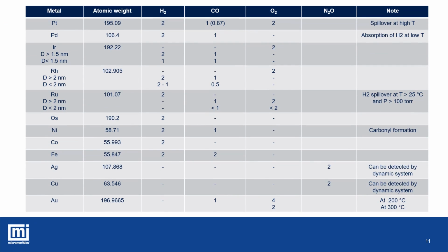The correct choice of the adsorptive should take into consideration the following factors. It must react with the metal, should have a short adsorption equilibrium time, should show a minimum effect of adsorption in the support, minimal effect of gas-gas interaction avoiding the multilayer formation, minimal effect of gas dissolution in the metal, like for instance hydrogen and palladium, and possibly the stoichiometry should be known.